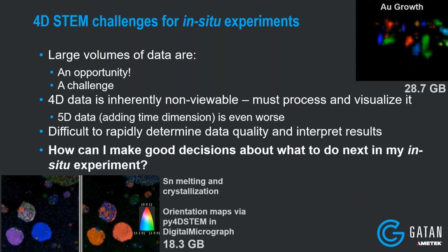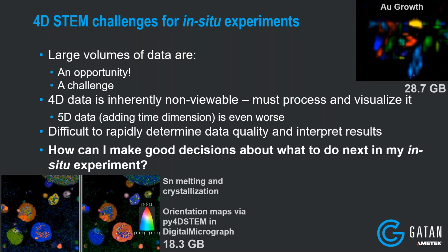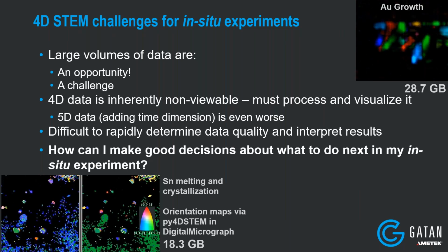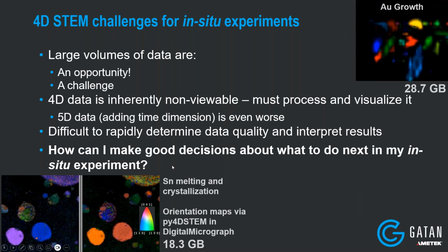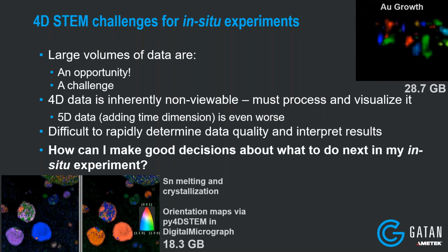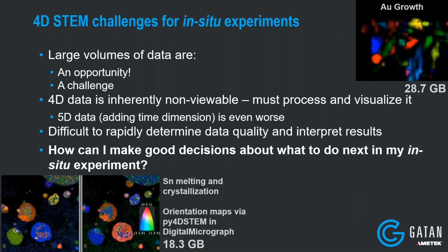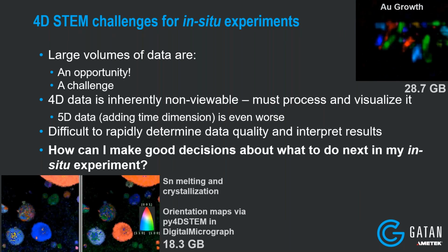It's much easier if I can visualize and analyze my data in real time while I'm still sitting at the microscope. And then I can very quickly make changes to the in situ environment, or to the microscope, right? To change the microscope parameters to get better quality data. But I can only do this if I can understand what's happening in real time.